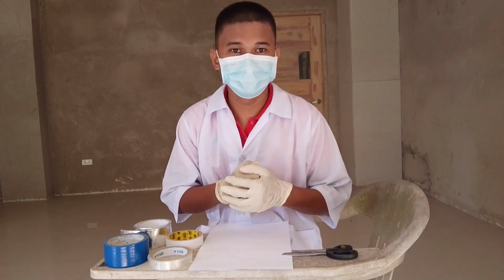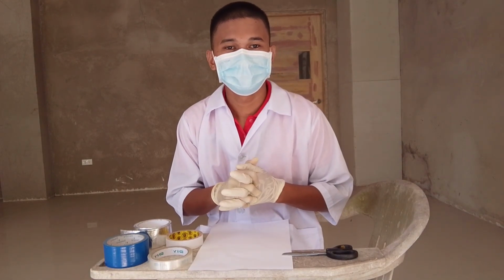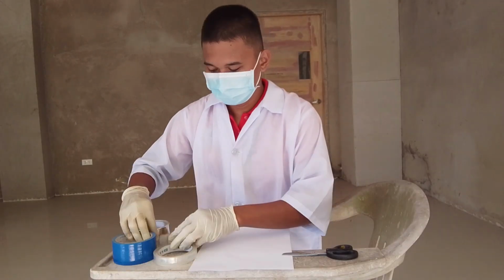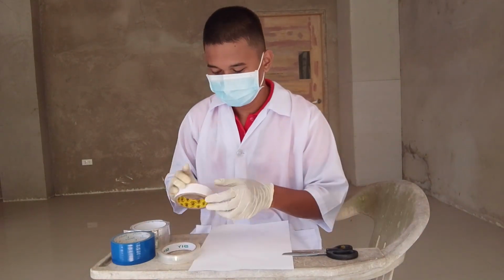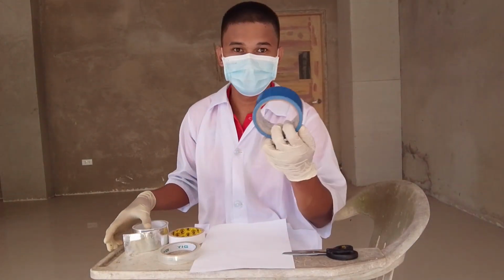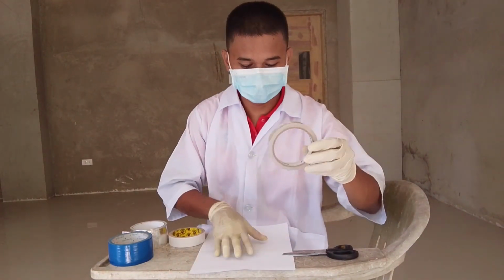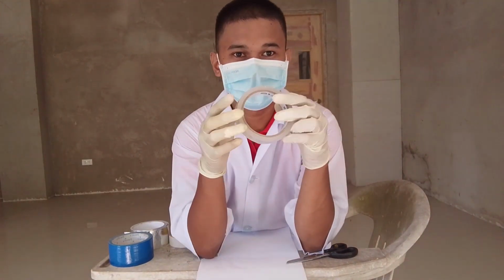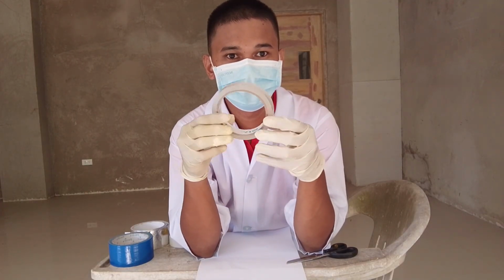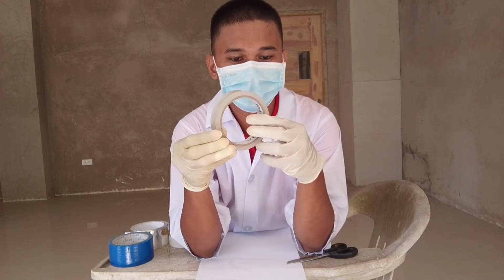So I will now proceed to identifying and examining the different types of tape. I have here the 4 different types of tape: the stationary tape, the double-sided tape, the aluminum foil tape, and the duct tape. First is the stationary tape.